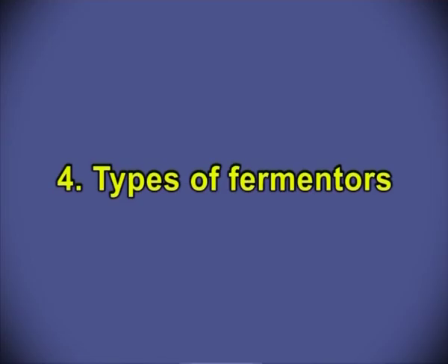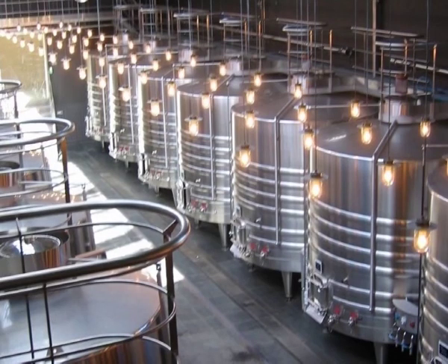Coming to types of fermenters. A variety of fermenters have been described in the literature, but few of them have been proved satisfactory for large scale fermentation.